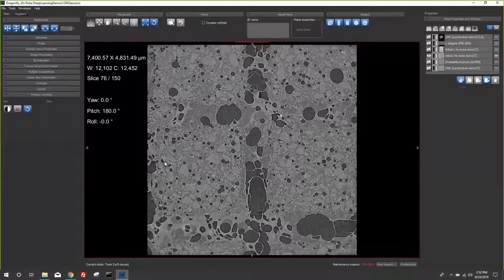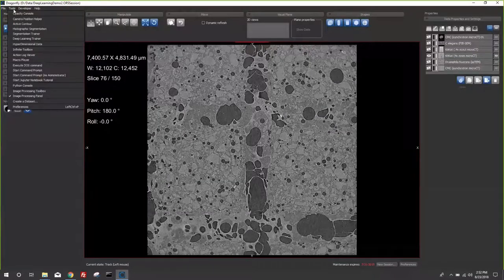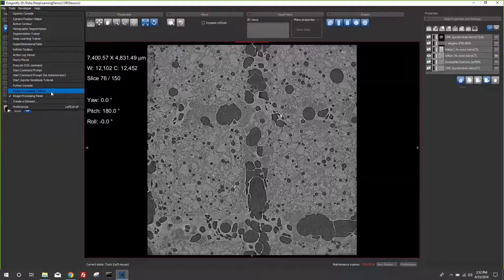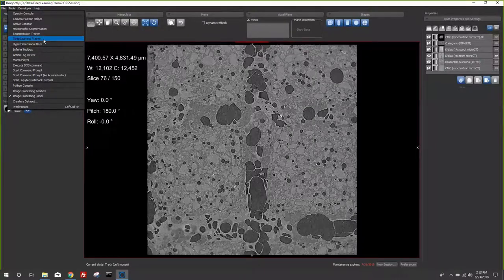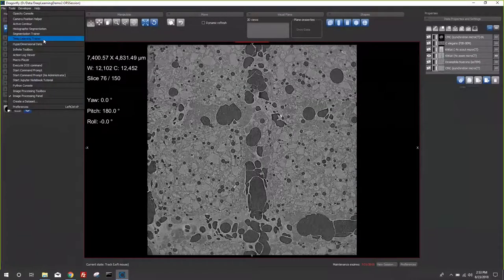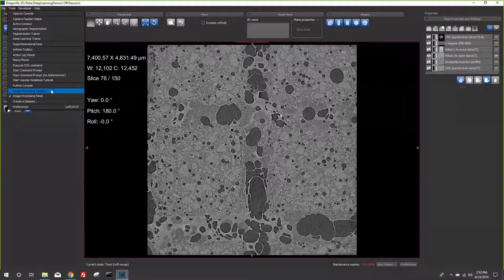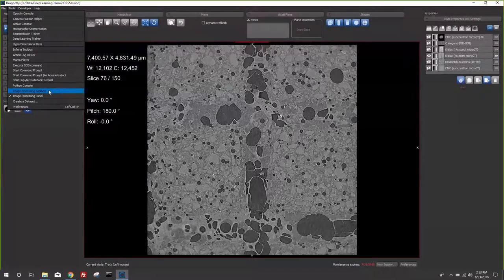There are two entry points for Dragonfly's deep learning solution. Under Tools, you'll find Deep Learning Trainer and Image Processing Toolbox. Deep Learning Trainer is where you build, configure, and train your neural networks — you can also preview as you train. This is your studio for designing and testing neural network models. Image Processing Toolbox is the standard place to apply any image filter, and it also gives access to all filters you've designed in your Deep Learning Trainer studio.